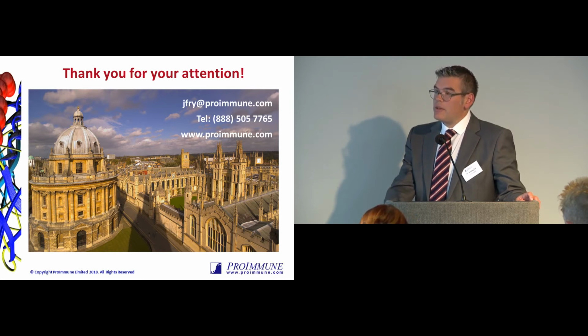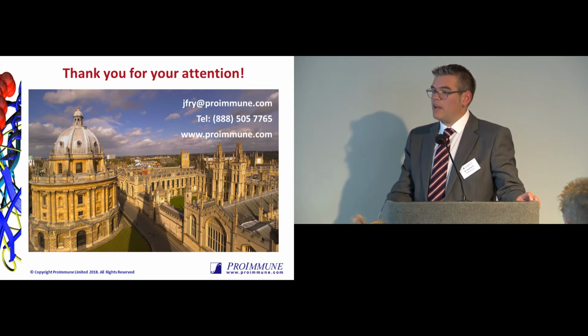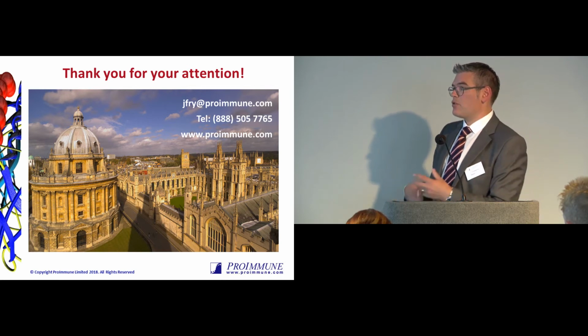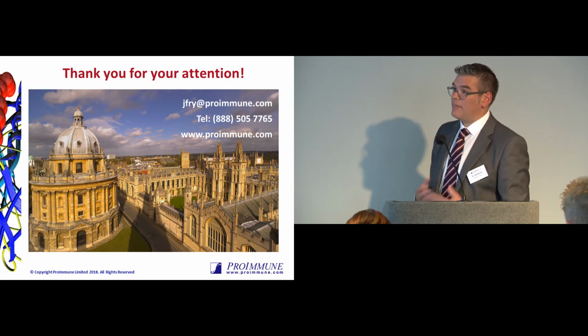Yeah, good question. We have done that once for a particular client that wanted to know that, so we can do that. The nice thing is that the donors we're drawing from are a local population, so we can get consent and draw blood not just for the cytokine storm but also to do flow cytometry analysis. So yes is the answer. We can do that, and we have done that before.